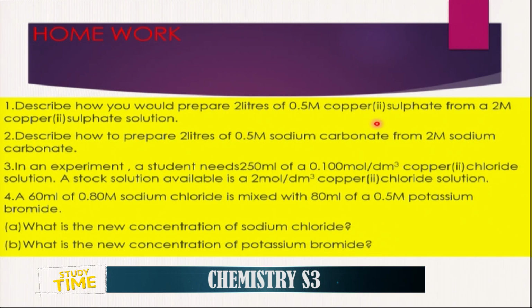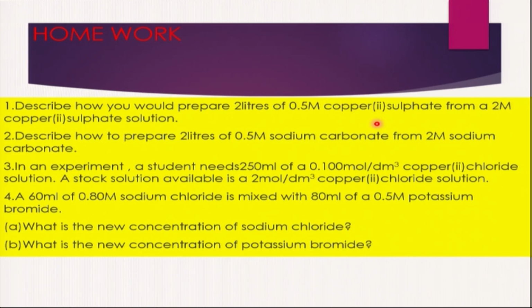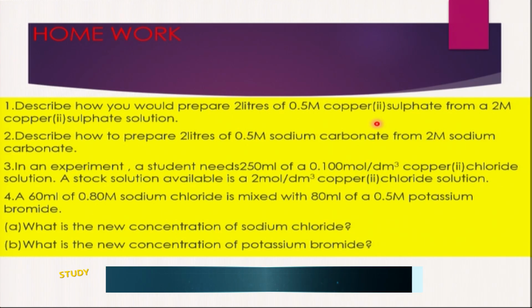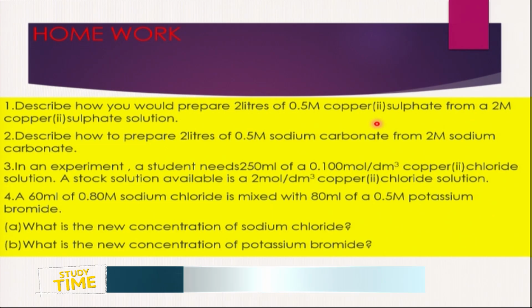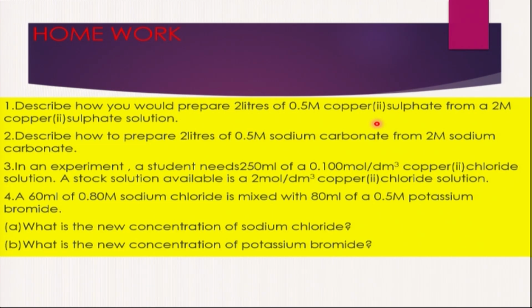After filling it, make sure you are very accurate, because when you are measuring these solutions, accuracy is a must. Therefore, the solution that you have prepared will be containing 0.5 molar copper 2 sulfate. So that is what you are supposed to do, even with other questions.